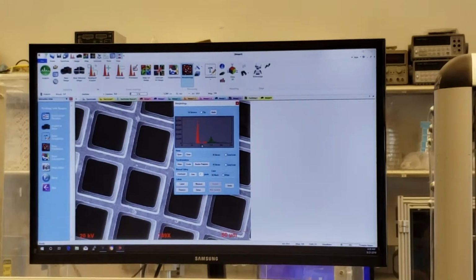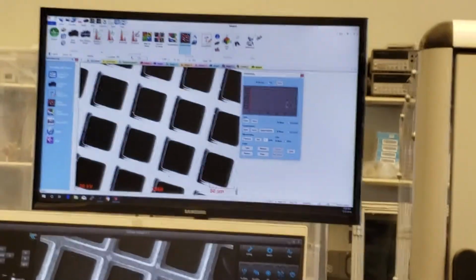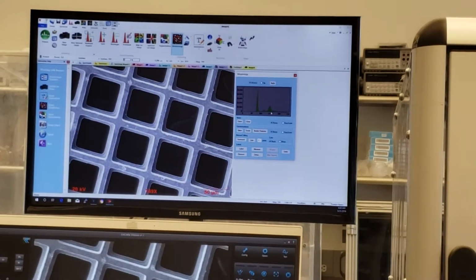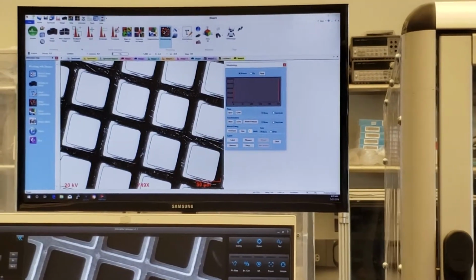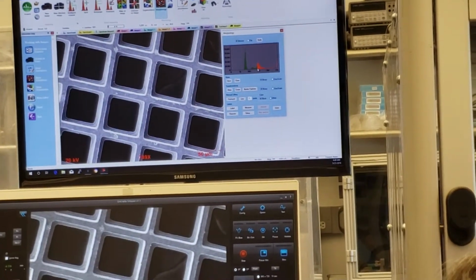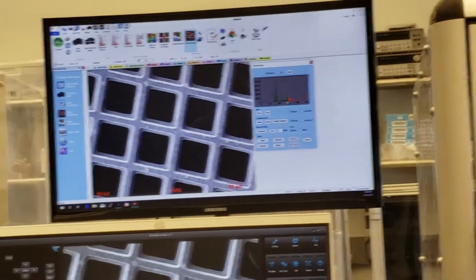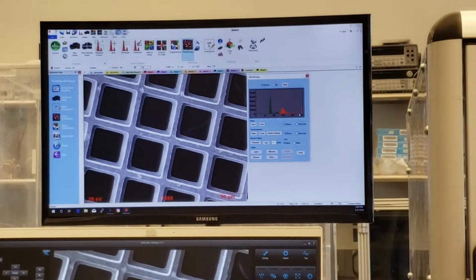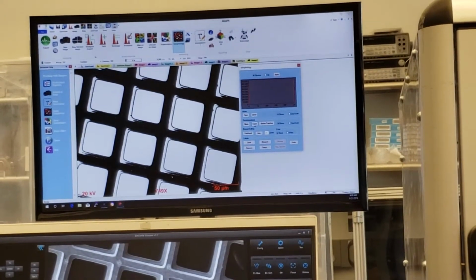So at any rate, again, with the imaging window, the morphology was there, and we could probably do something with morphology on this. Hang on a second, because I can make the black think it's white. Hang on, let me go undo. Let me reverse this. Let me take that and bring this in here. Let me switch this around. Okay, great. So everything it sees as white, it's going to think it's a particle. Hang on, let me just make that a little better. Apply that curve. Make it a little bit smaller. Okay, that's better. Let's go erode.